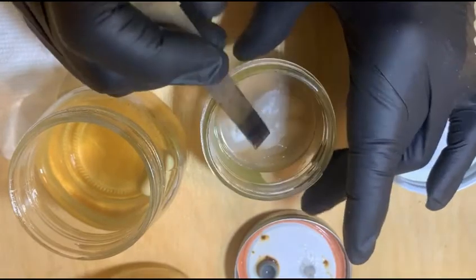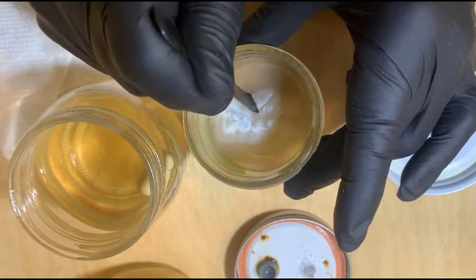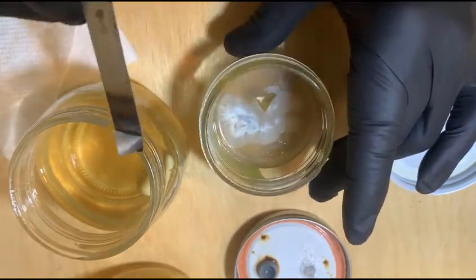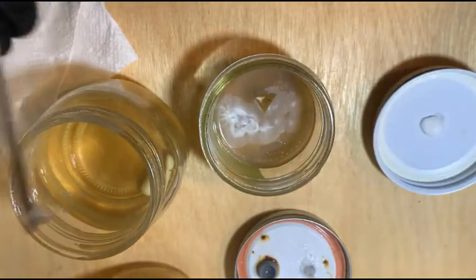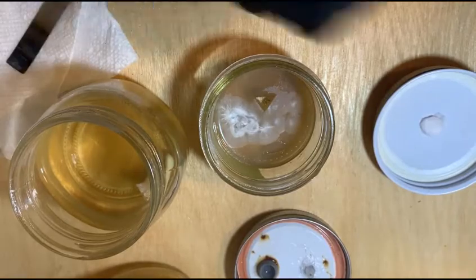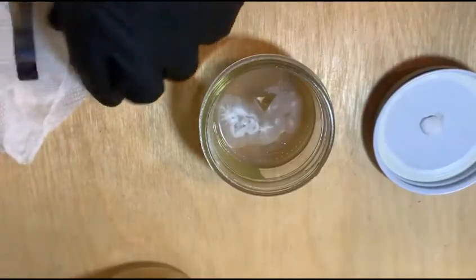Select a region like this — triangles are probably the easiest. And into the culture. It's that simple. We hope that that grows without contamination, and we'll see.